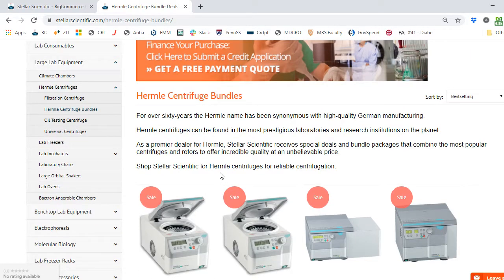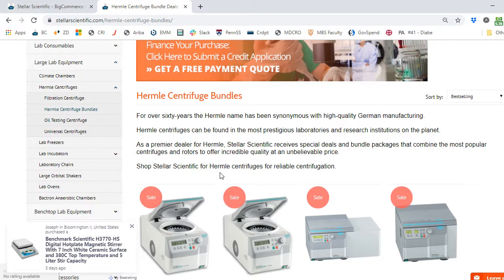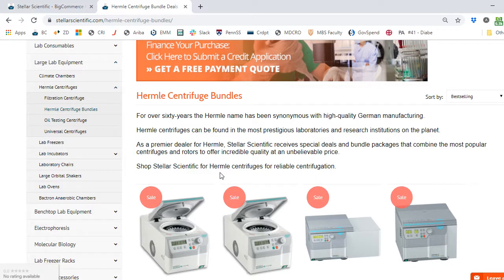Now let's show how to use the tool when you know what you want but can't get an exact fit. For this exercise, I want a refrigerated benchtop centrifuge with a swing-out rotor that will work with 15 mL conical centrifuge tubes. It should be refrigerated for cell culture. But I also want a rotor that can spin 15 mL tubes at a speed exceeding 10,000 times G for a specific lab application. So I want more than just a bundle — I want to build a centrifuge from the ground up.